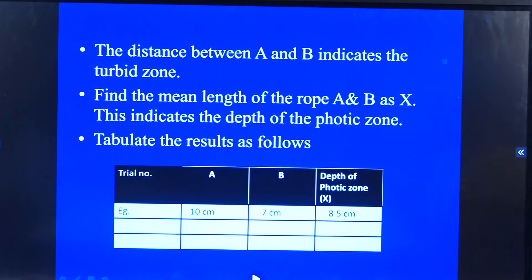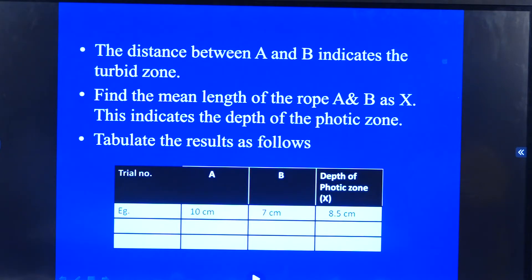The distance between A and B will indicate the turbid zone. Then we will find the mean length of the rope A and B as X, and this will indicate the depth of the photic zone. Later on, we need to tabulate it.